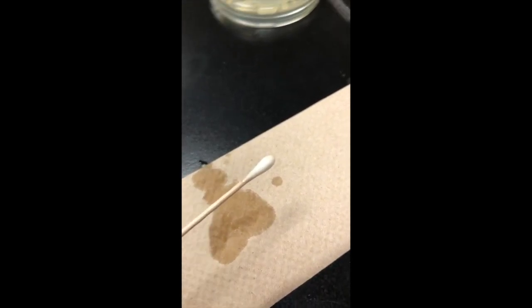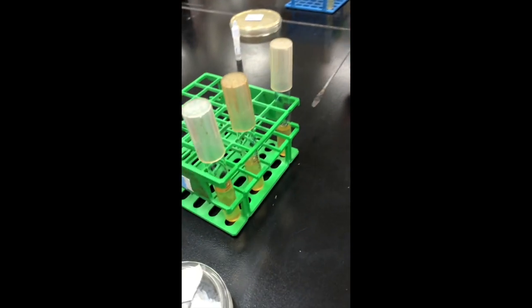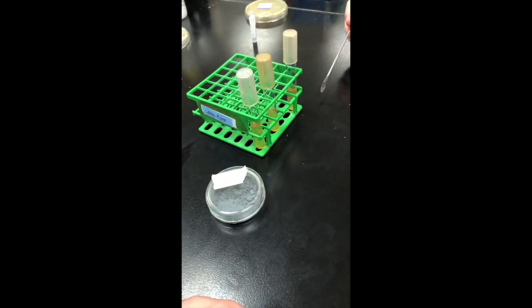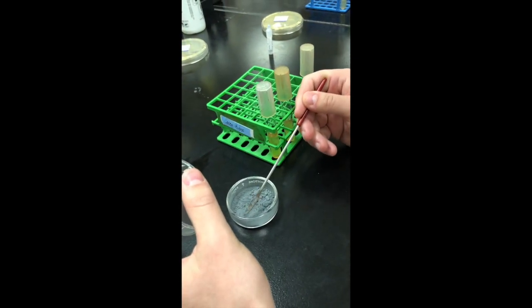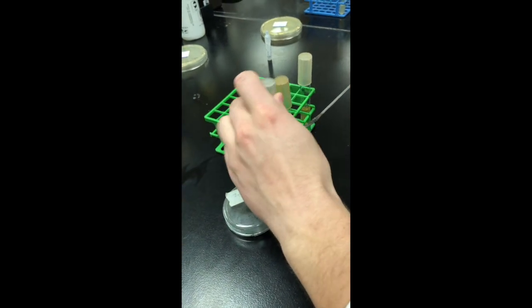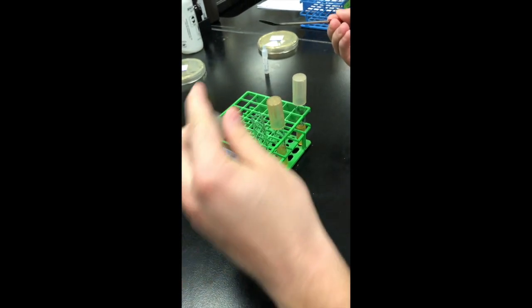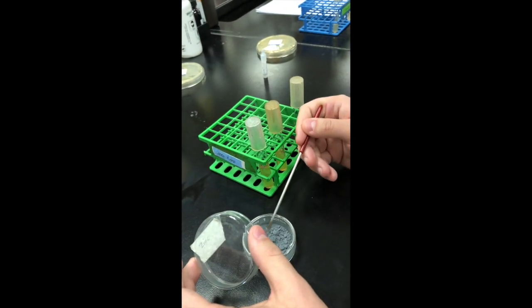Let me know. Going back to our nitrate test. Notice none of them are currently red. So we're going to add some zinc dust to each tube and wait just a couple of minutes. We just add a small amount. Zinc is a catalyst that actually takes nitrate and converts it to nitrite, and that would cause a pink color to form.